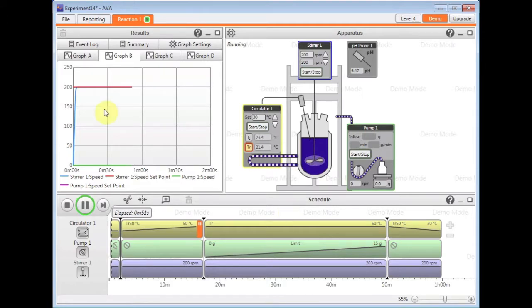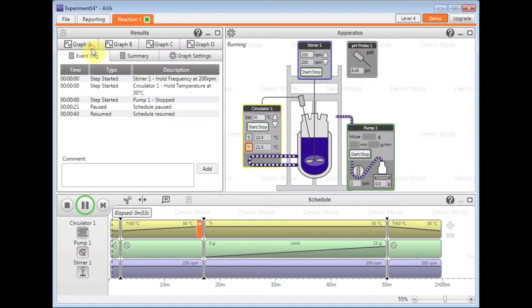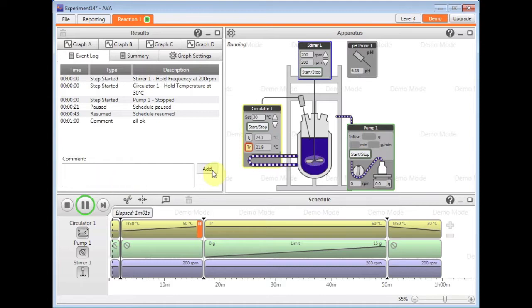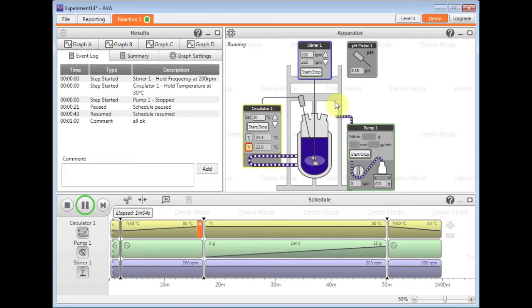The event log in the results window here can be used to add comments to your file. This is time stamped and put against the data from each of the devices so you know exactly what was happening at the time.